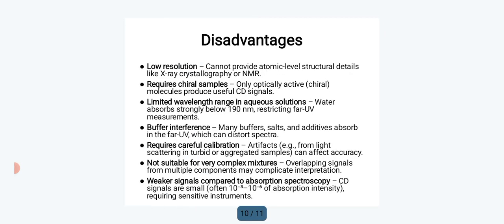Apart from that, there are disadvantages also. Low resolution power: it cannot provide atomic-level structural details like X-ray crystallography or NMR. It requires chiral samples; only optically active molecules produce useful CD signals.